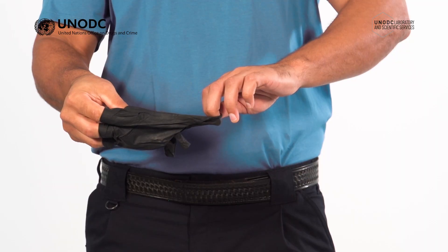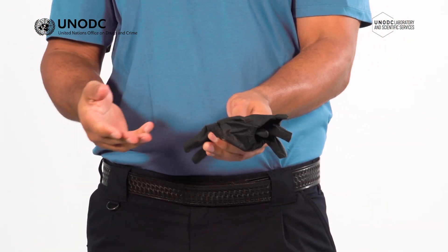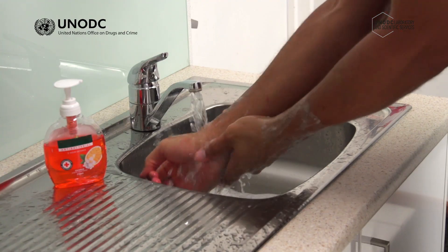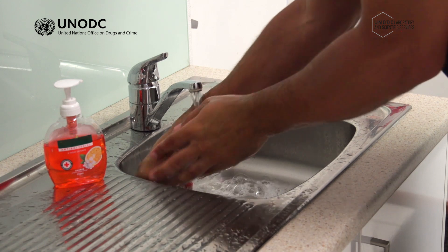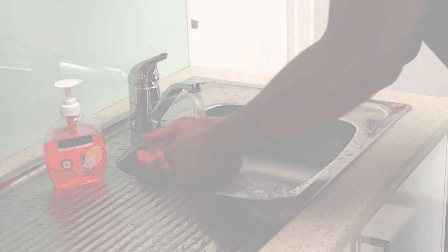As the gloves come away from the hands, make sure you don't flick the gloves by removing them too quickly. Now that the gloves are removed, immediately put them into a contaminated waste bag or bin for disposal. Once you have removed a pair of gloves, it is good hygiene practice to wash your hands or any exposed skin such as forearms for at least 30 seconds to 1 minute with soap and water.